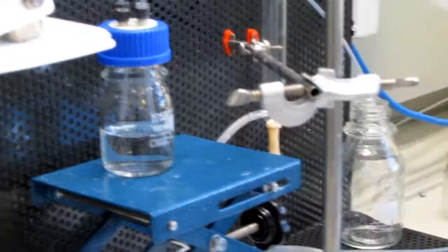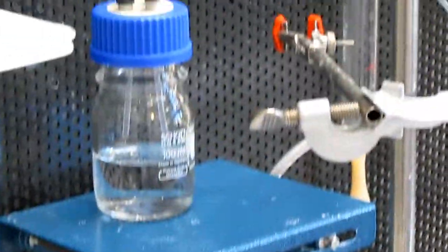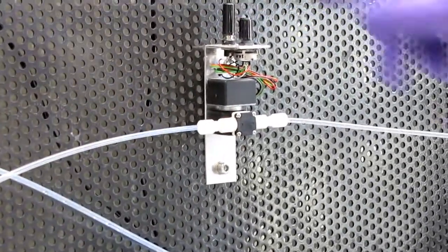Let me check. Okay, everything's fine. We can first recycle the anolyte and make sure the membrane is wet. If the membrane is dry, it will die. Cycle, see, it started cycling.